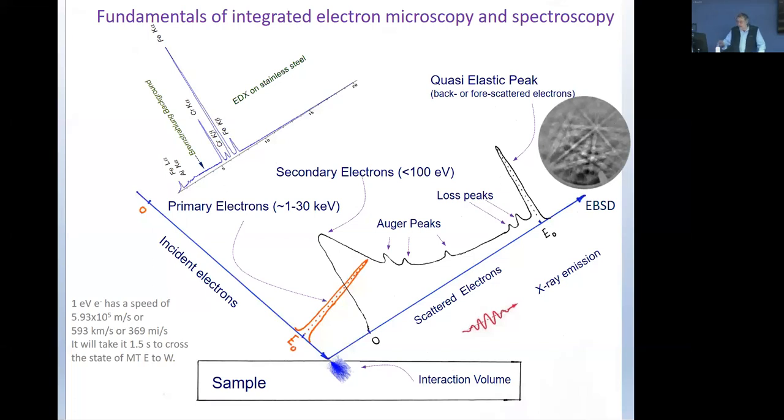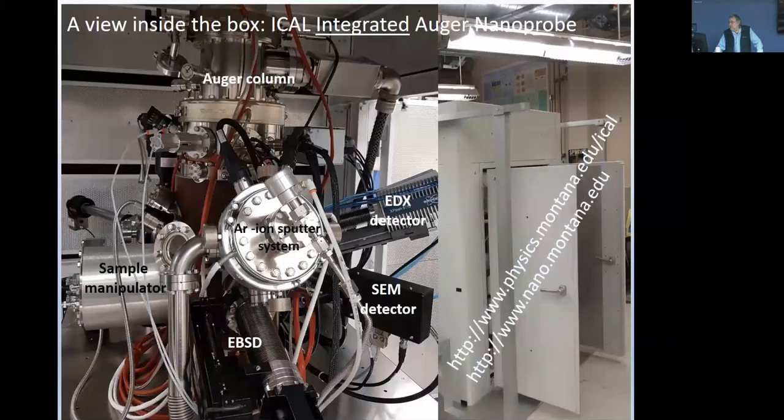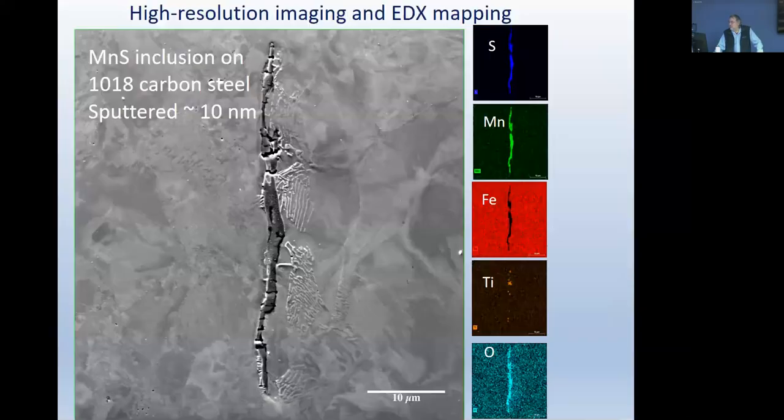Here is an example. Right here, this manganese sulfide inclusion has titanium. Overall, you will not see too much, but if it is localized like that, I can 100% analyze these kind of things. Are you seeing this maybe or not? Yeah, I see it.